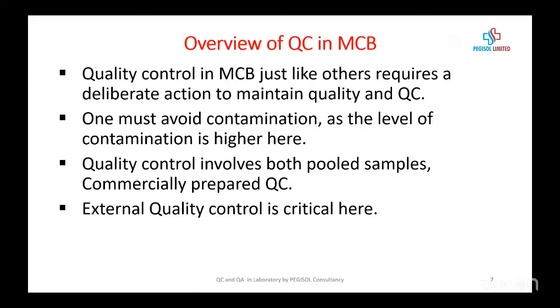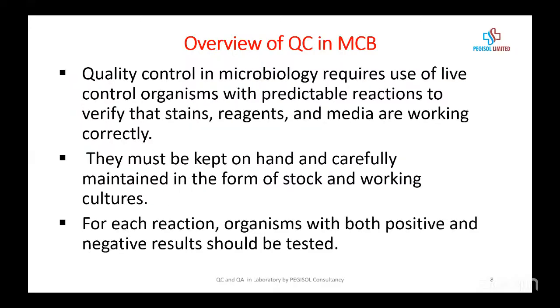Quality control in microbiology requires deliberate action to maintain quality. One must avoid contamination, as the level of contamination is higher here in the microbiology lab. Quality control involves both pooled samples and commercially prepared QC. External quality control is critical here and also in other places.